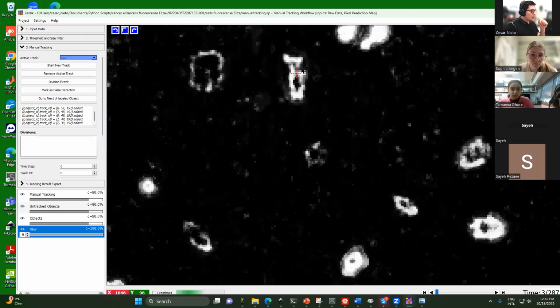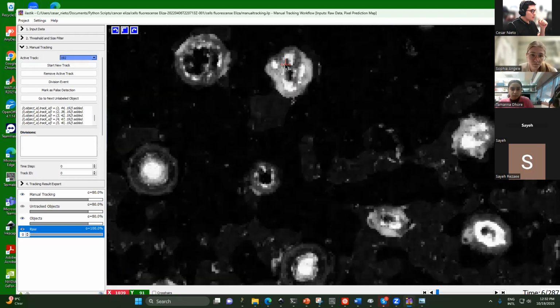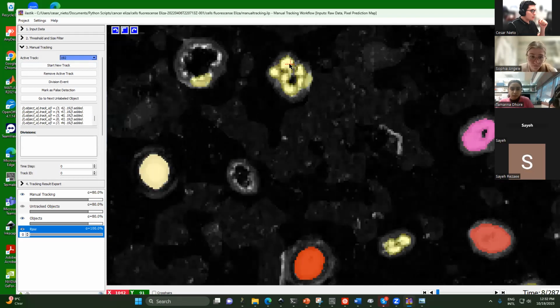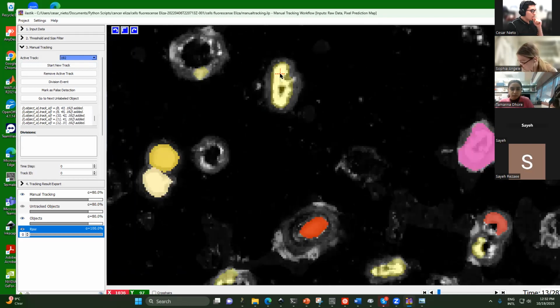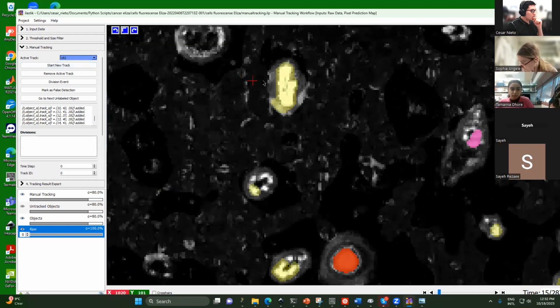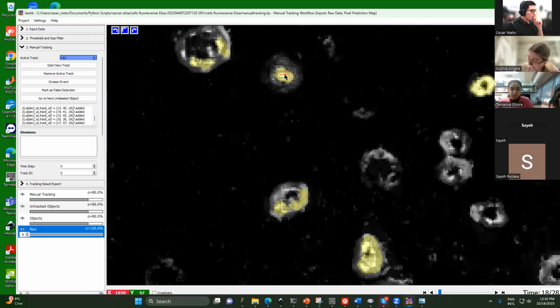And I track the cell for all the time the program detects it. I'm just clicking the segment, and the program is going to give it the name of 192. So I did it for all the cells.